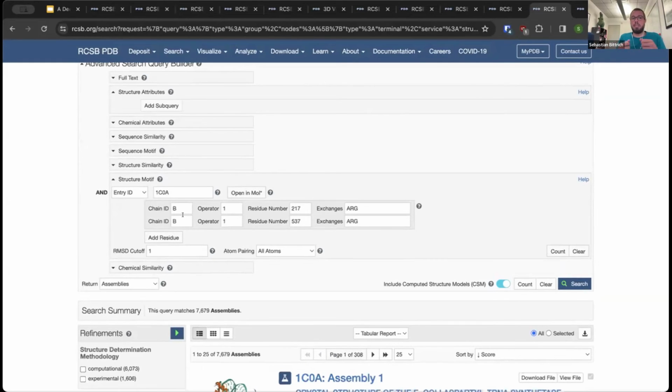So you could try to add additional residues and make it more specific, or to arrive at something that describes a binding site with more information, which will effectively reduce the rate of false positive hits or of not biologically functional proteins in your result set, depending on how you define your query.